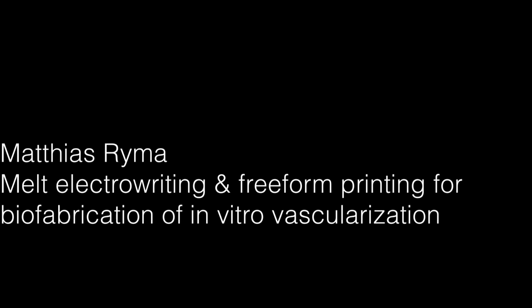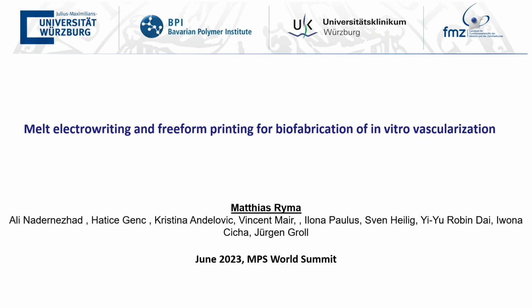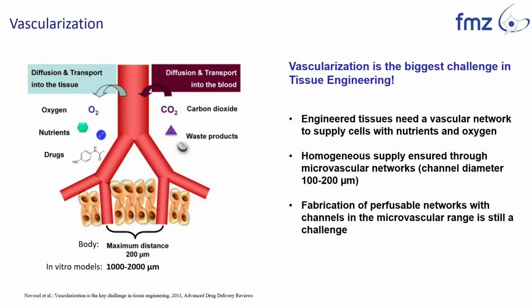Okay, hello everyone. Today I'm going to present to you a biofabrication method for the in vitro vascularization of in vitro tissues. First of all, vascularization is still the biggest challenge in tissue engineering. If you want to create significantly sized tissues, you need to have a vascular network from the beginning of the culture which is perfusible, otherwise your cells will die in the construct and they create necrotic cores.